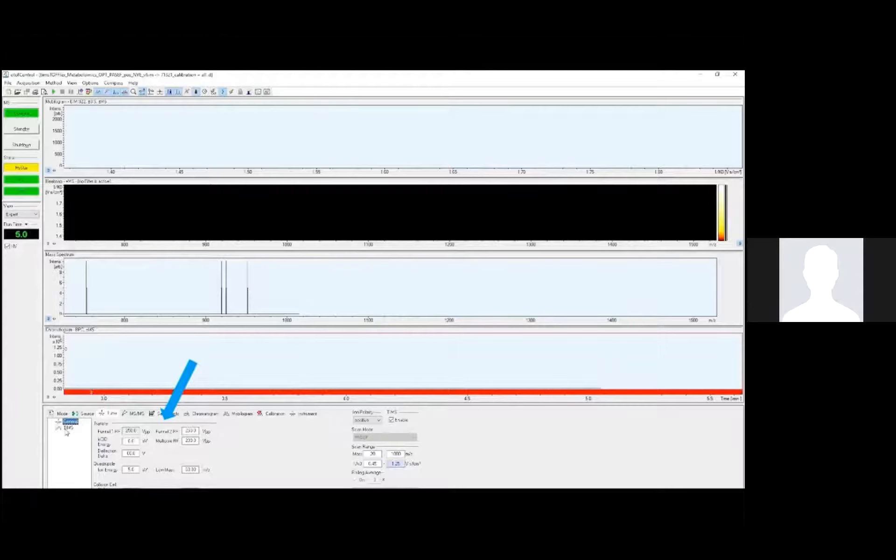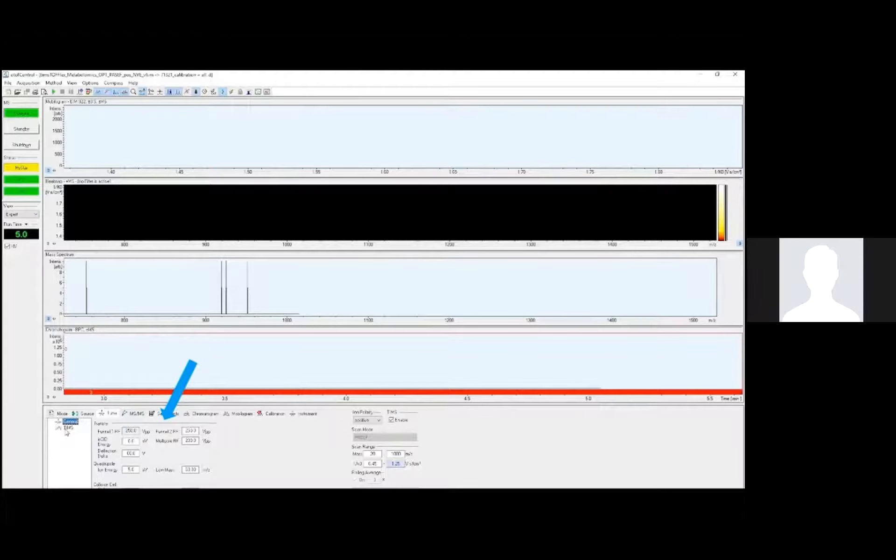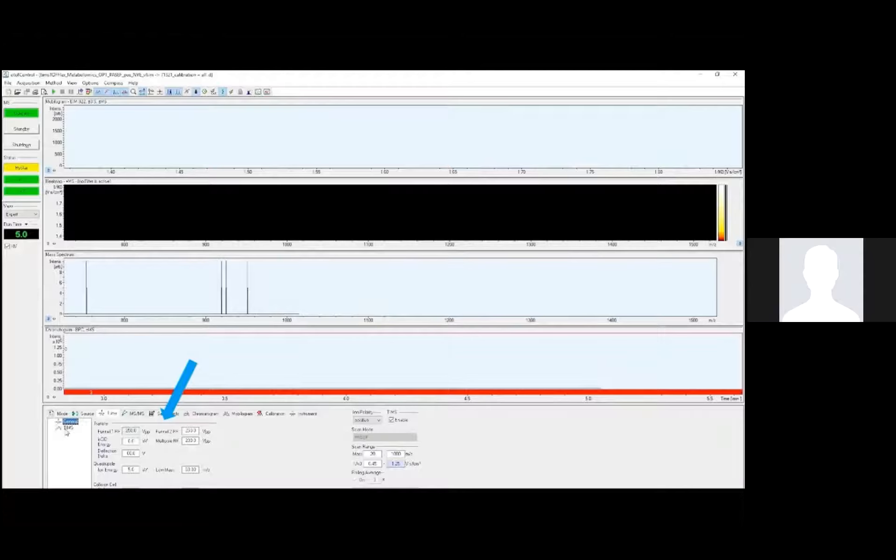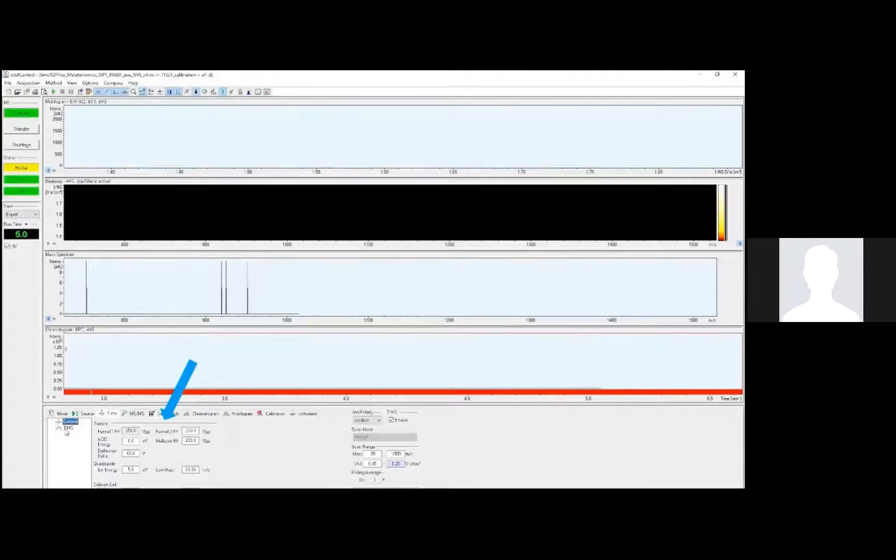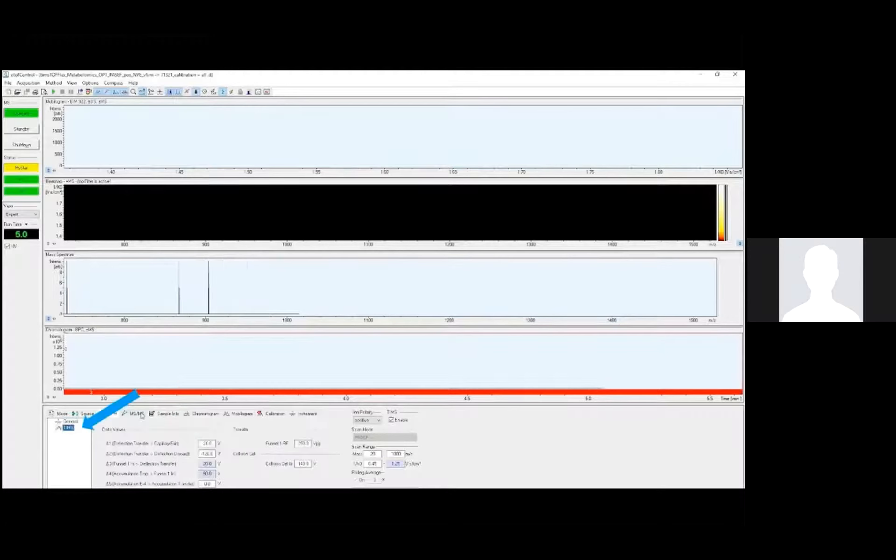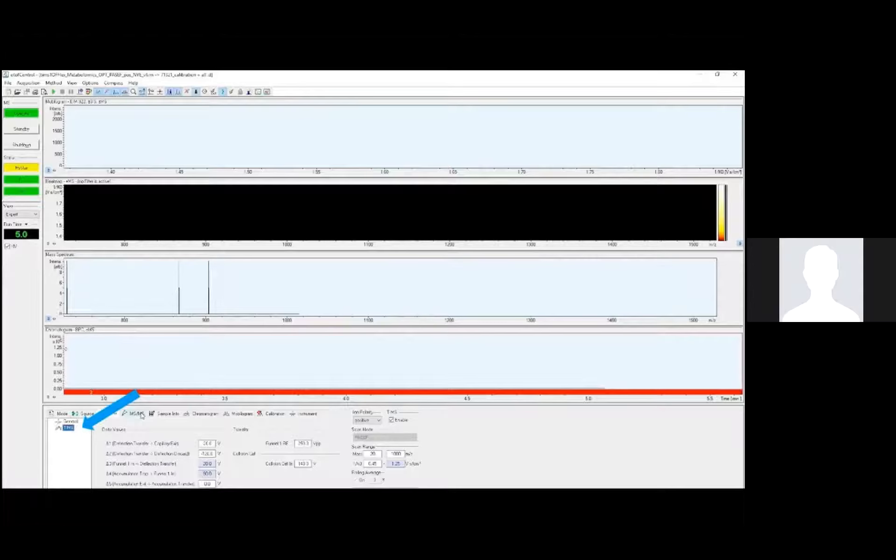This tune tab has a few very important settings for the mass spectrometer that help determine what size of ions are able to pass through it. These settings are more relevant to the mass to charge of which ions can pass through than the actual scan range that I just talked about on the right hand side. These settings are essential to making a method appropriate for small molecules, peptides, lipids, or whatever you're looking for. Usually the manufacturer provides settings that are very close to what you need for a given application, or they at least provide a very good starting point. Similarly, these TIMS tuning settings are critical to helping the correct size of ions pass through the trapped ion mobility cells at the front. Bruker provides these settings for a given application, and in my experience these do not have to be altered.